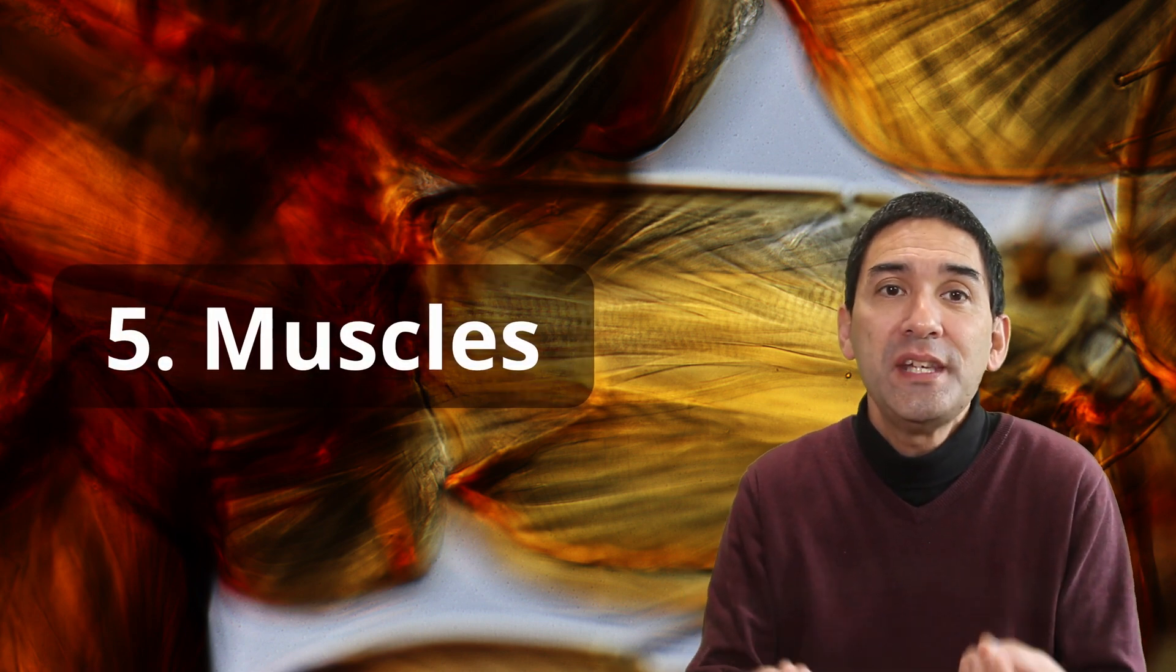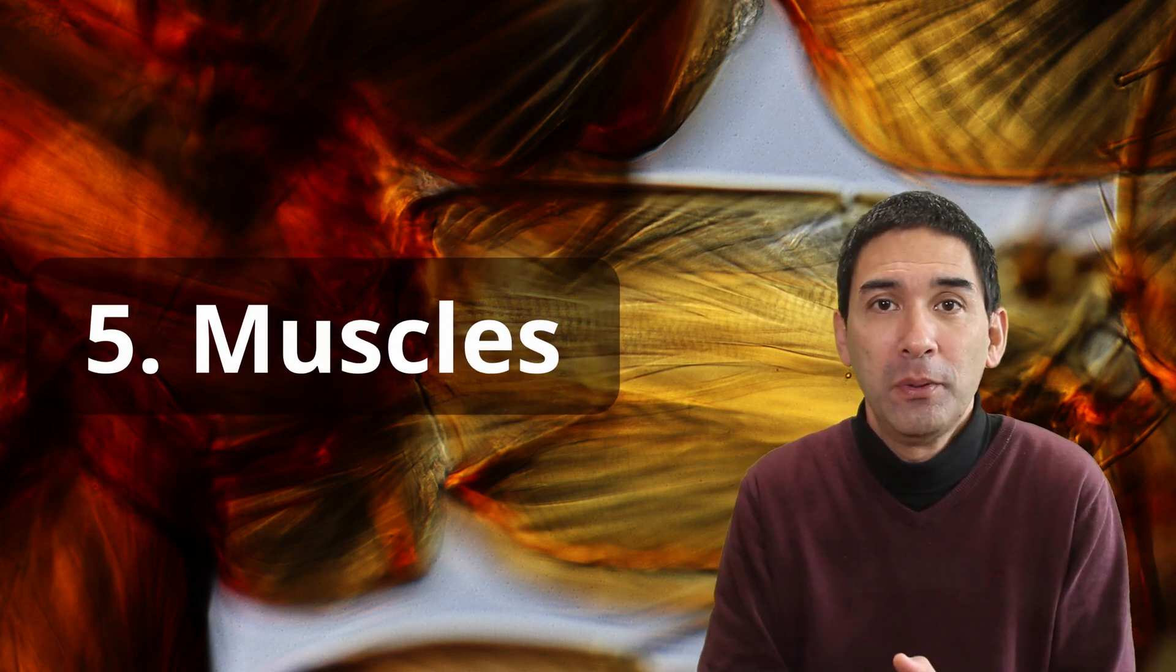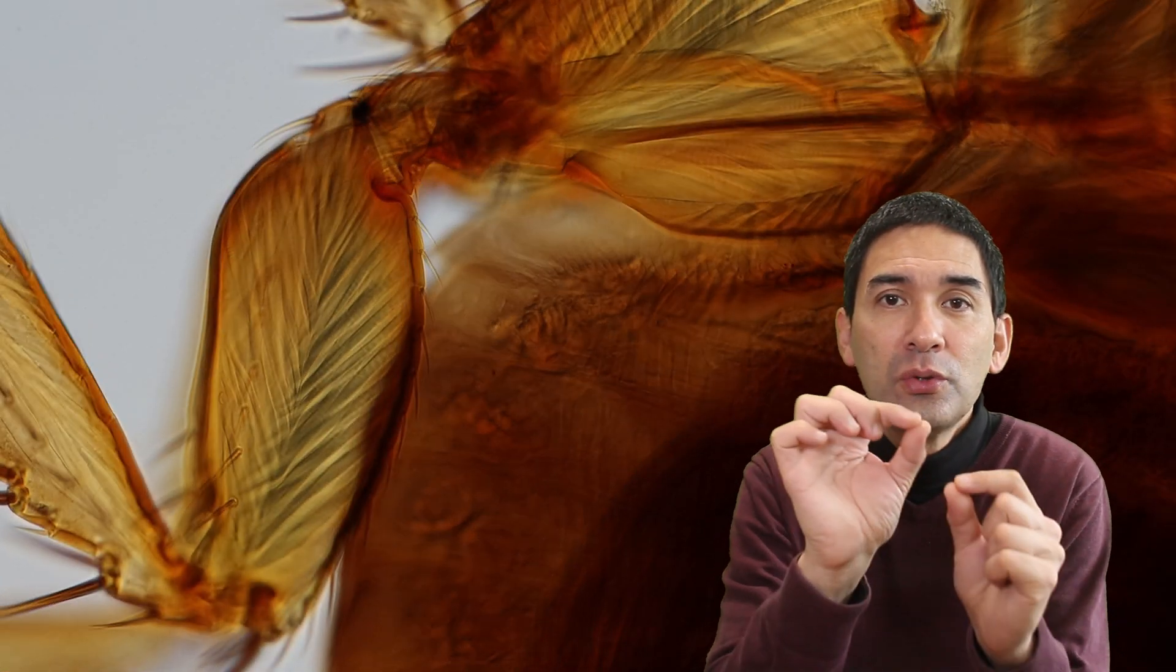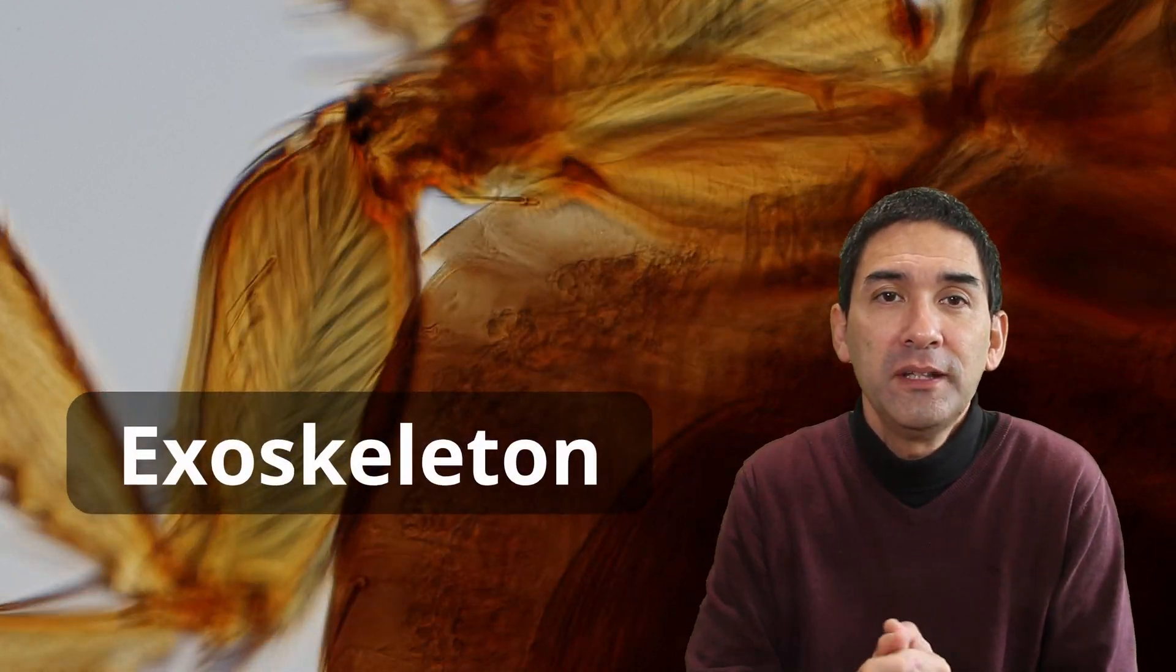First of all, fleas have a lot of muscles and we're able to see these muscles under the microscope. Fleas have to be relatively strong and we can actually see those muscles by looking into the flea itself. The muscles are attached to the inside of the exoskeleton of the flea.